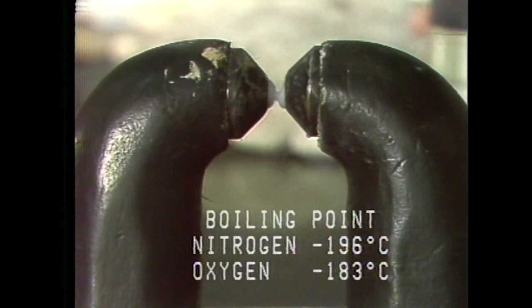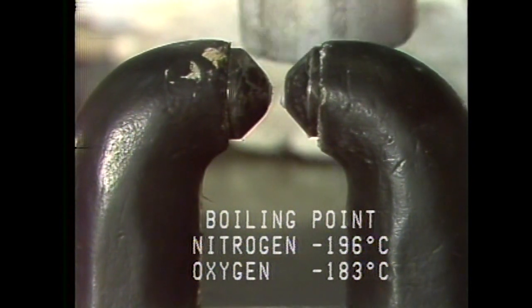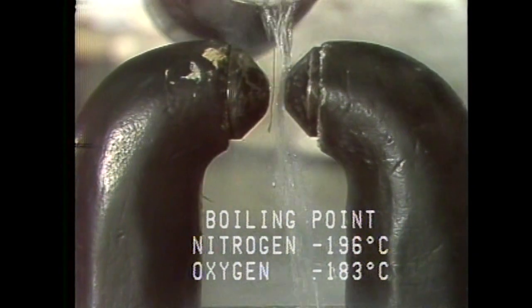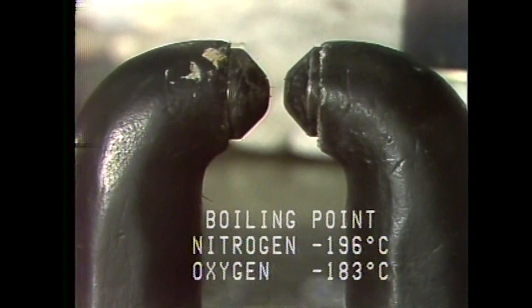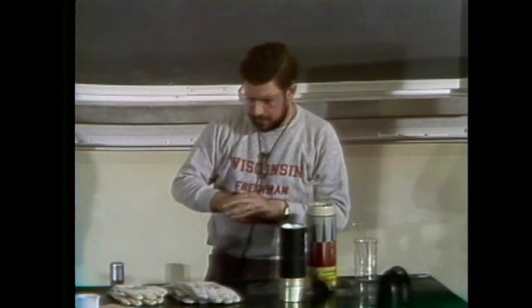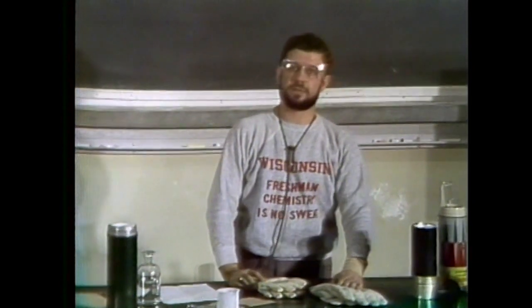And as it boils away, then we don't have any oxygen anymore. Just to show you the difference between the nitrogen, let me add some nitrogen here, and you see nothing happens there.